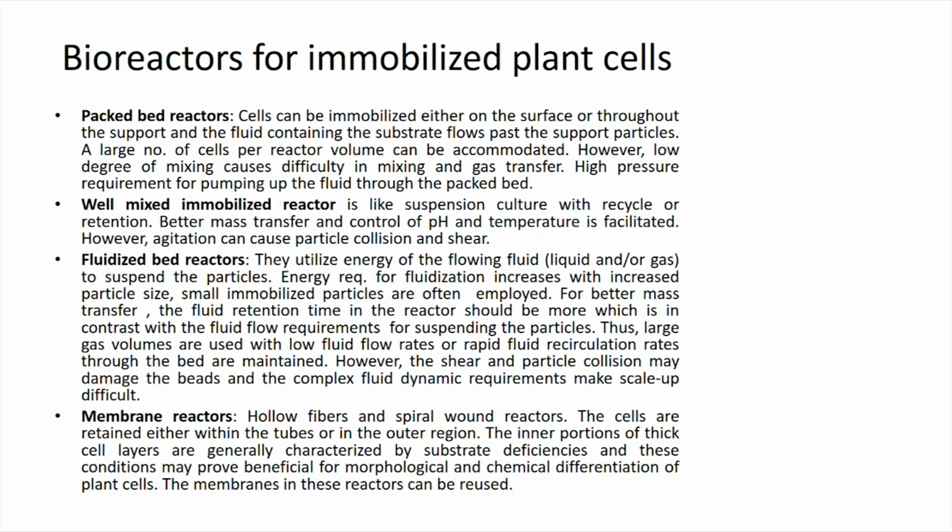Then fluidized bed reactors, in which, from the packed bed reactors, there is fluid movement to improve the mass transfer, but the only way the cells are kept suspended depends on the flow rate of the fluid flowing, because the fluid flow rate will determine the suspension efficiency of the cell mass also. Now, if I improve the flow rate, there will be better suspension, but then there is lesser time given for the mass transfer to happen.